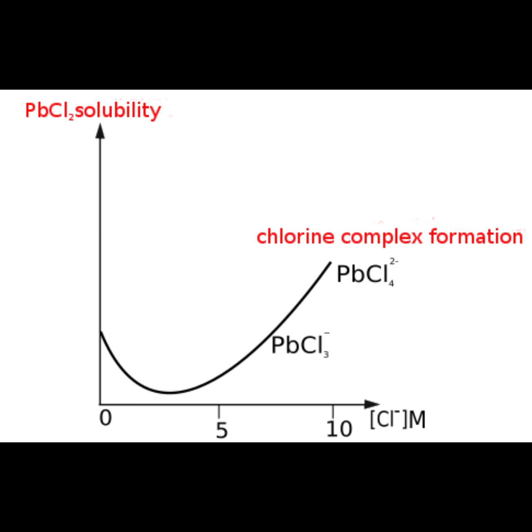Separation of Pb2+ from Ag+ and Hg2 2+. We have seen that among chlorides precipitates of group 1, the most soluble is lead chloride. Its Ksp around 10^-5 tells us that it can be dissolved quite easily by dilution. Adding water means lowering the concentration of the constituent ions. Considering Le Chatelier's principle, the equilibrium will move to the right, and in this context it means that the precipitate will solubilize. Furthermore, the solubility of this species increases with temperature.